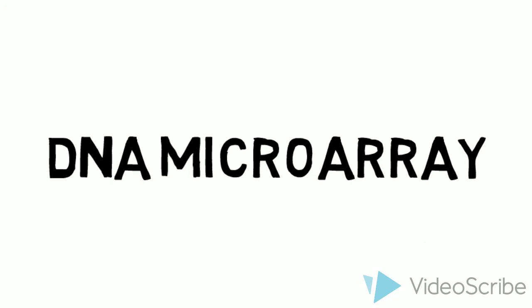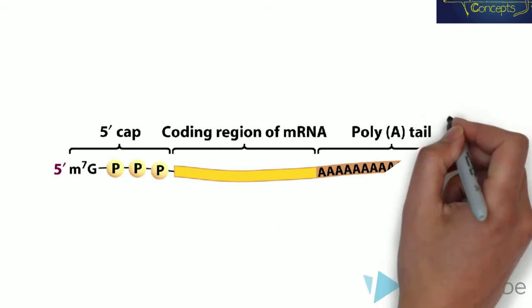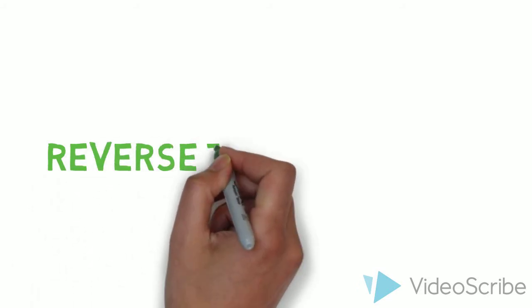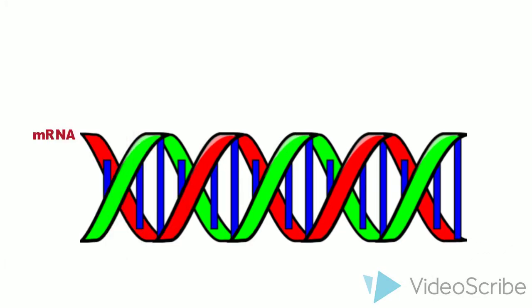mRNAs are mature sequences of RNA transcribed from expressed genes in the cell of interest. In order to measure gene expression, we need to isolate these mRNAs. This is done using reverse transcriptase, which binds complementary dNTPs to the mRNA sequence, creating single-stranded cDNAs.